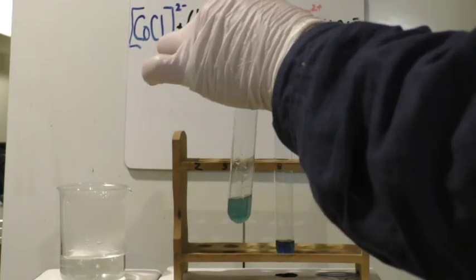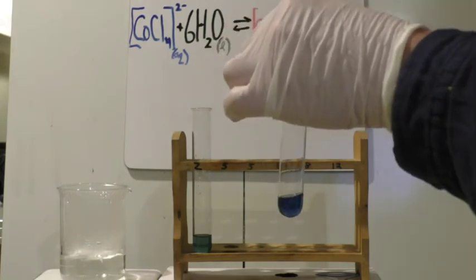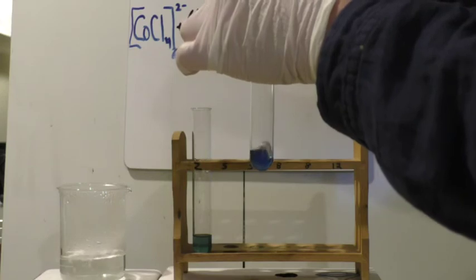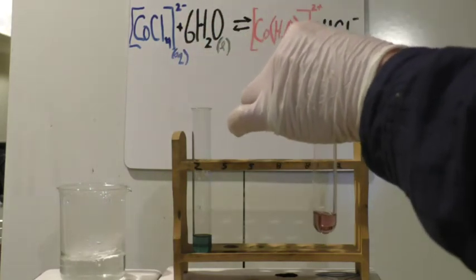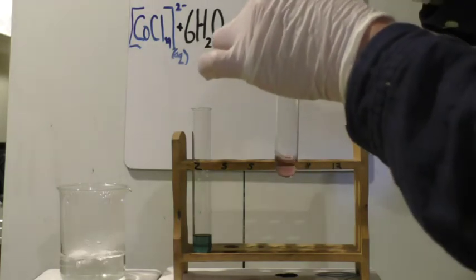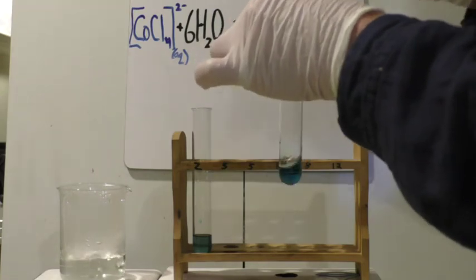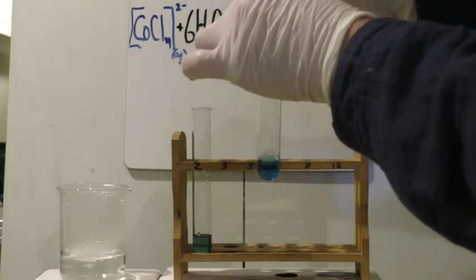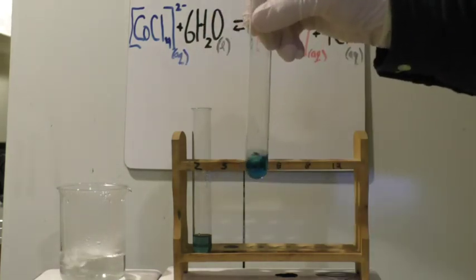It's actually getting a little dilute, so I'm going to go back and start over with this one. So I'm going to take this fresh cobalt in ethanol solution. I'll add a little bit of water. Too far. So that's okay. I'll drive it back to the left with some chloride ions. There we are. Let's really push it over there. So we're firmly, equilibrium appears to be lying to the left.